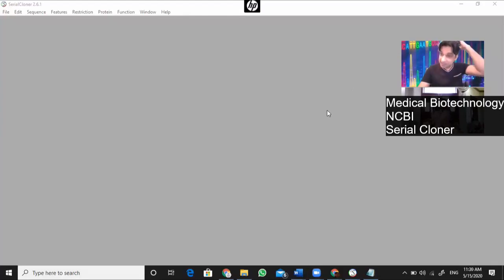I think मुझे second session लगाना पड़ेगा. मैंने सोचा था नहीं करेंगे. Anyway, so let's see. Let me how we can compare them.